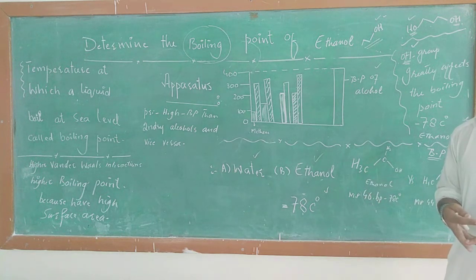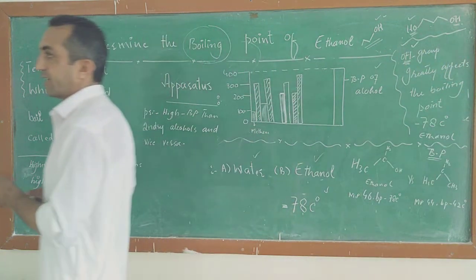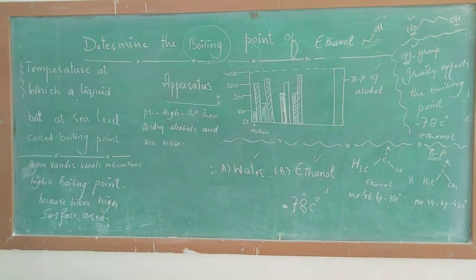This will be our today's experiment, and now let's demonstrate this so that you can perform it inside your home and write down the procedure and the chemicals that you will need. So let's demonstrate it now.